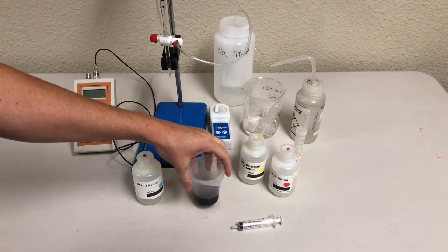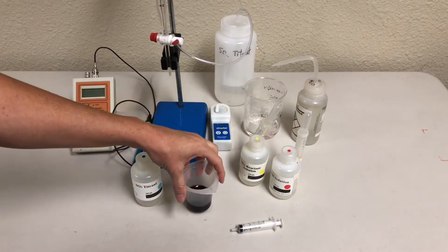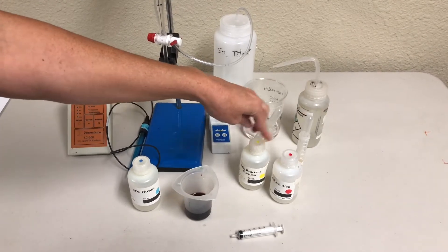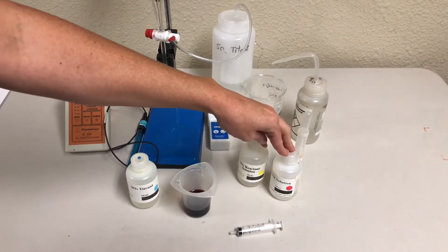After collecting a 25 mil wine sample we are now ready to run the test. You will need to add 2 mils of your SO2 reactant and 2 mils of your SO2 acid solution.